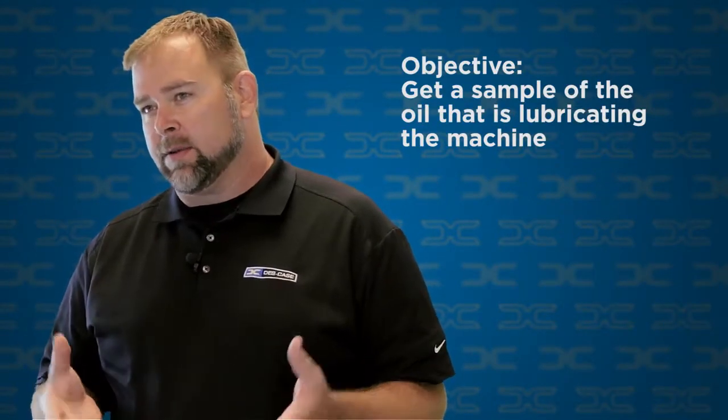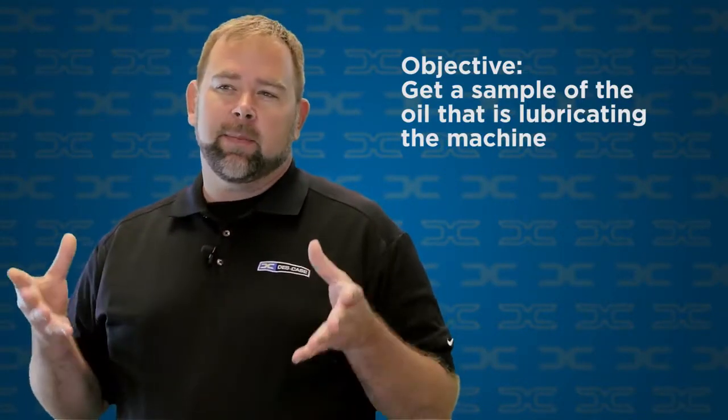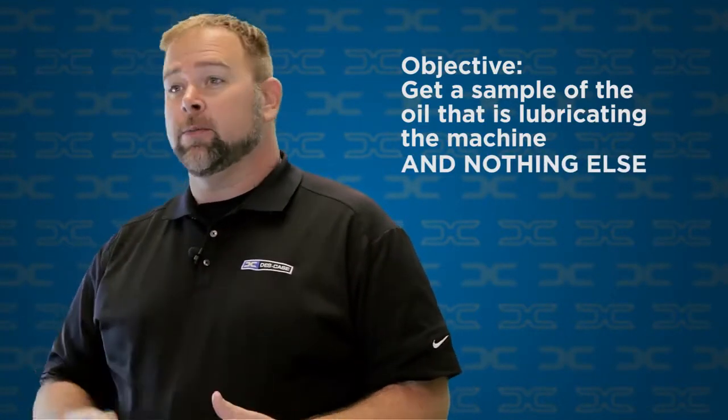So our objective when we take a good oil sample is really to get a sample of the oil that's lubricating the machine. So the oil that's actually between the gears, the oil that goes through the bearings or through the hydraulic pump. We want to see a sample of that oil and nothing else. We don't want information about the tube that we're pulling the sample through, or the machine that we just sampled, or the outside of the reservoir or the sump. We want to get a picture of the oil out of the machine, and we want to keep all other information out of that sample.